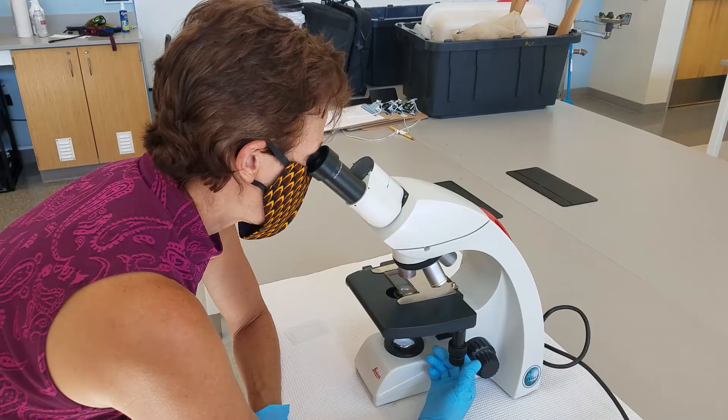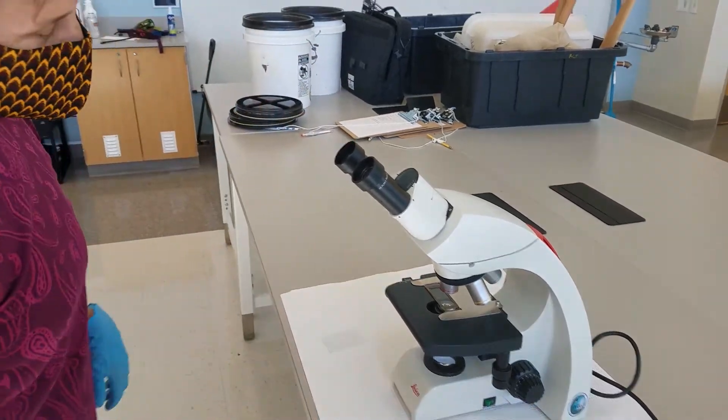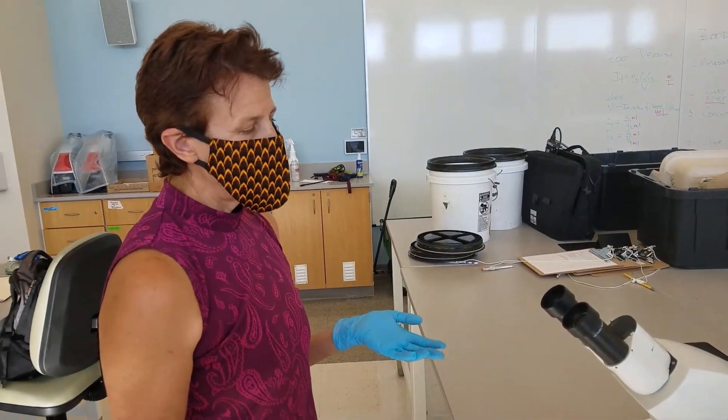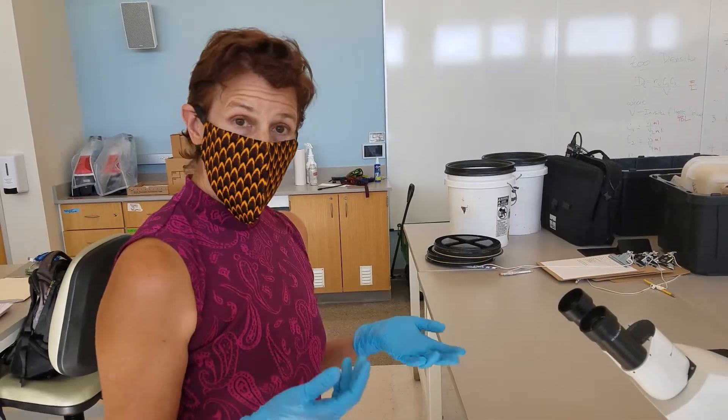I'm seeing a bunch of algae — let me move it around and see if I can find something. This would be a great algae ID session, but we use a different method to do that and we don't do that in the lab. I've zoomed in so that I can see organisms and algae.